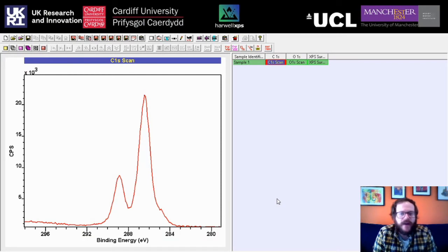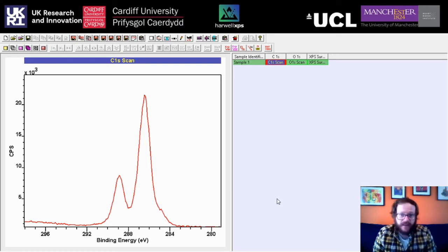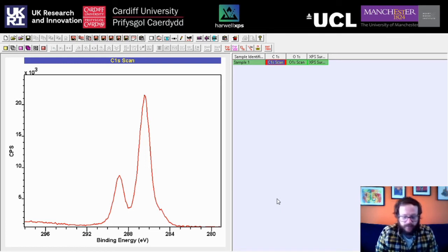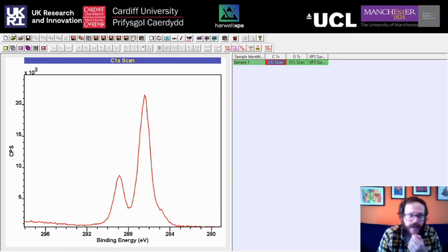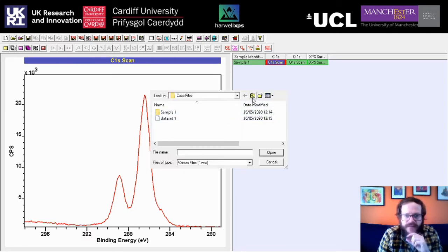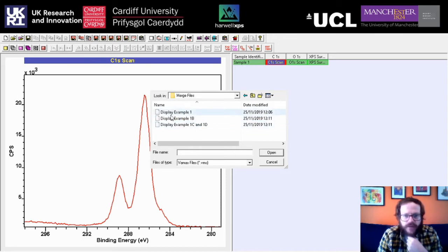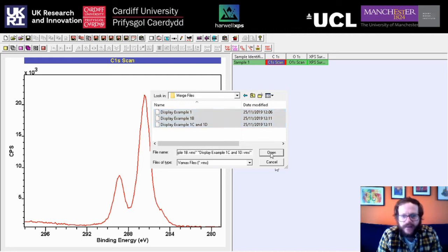If you've been using this method you should now have all of your files on the right-hand side. If you have files from a different source and you'd prefer to have them all in the same place — I tend to like working with all datasets in a single file — we're going to go through one of the ways to combine everything. Go to File and go down to Open and Merge. Using this option, find your extra files, then drag a box or use Shift to select all of the files you wish to open and merge, and then click Open.